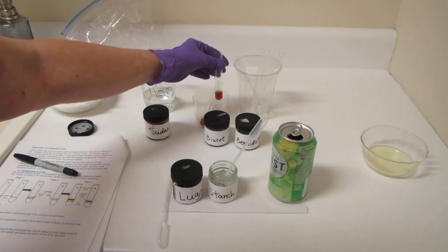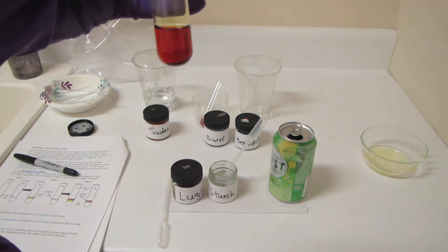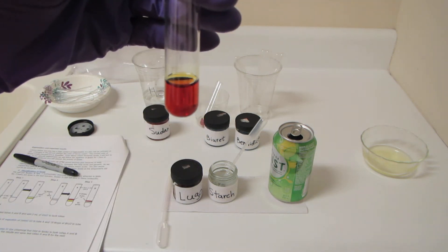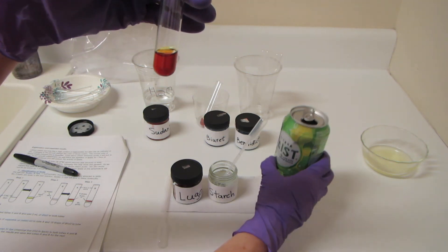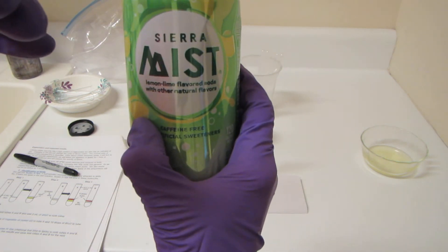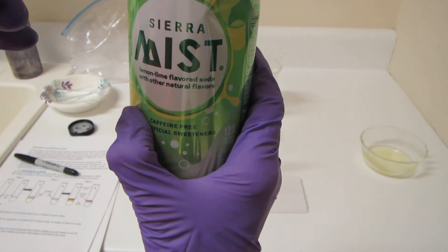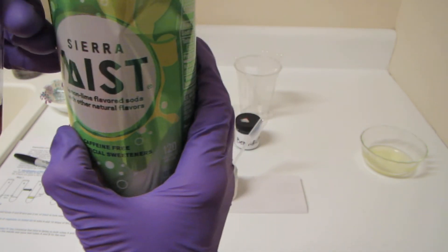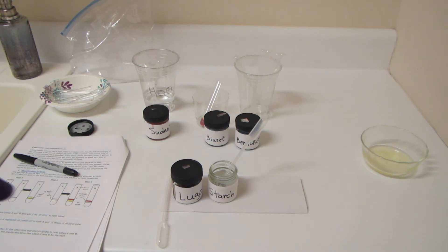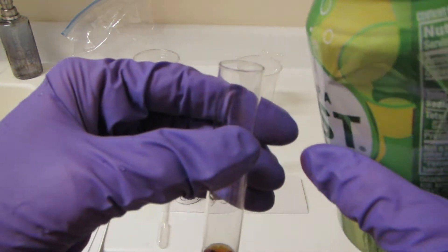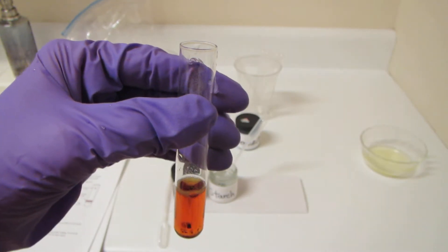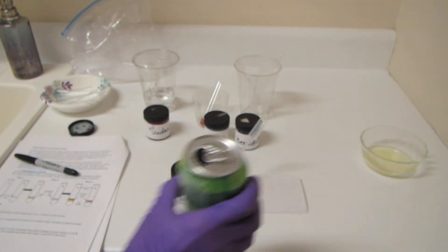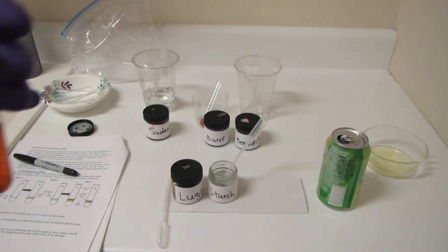I'm going to take one of these and put something in it that contains simple or reducing sugar. Look, we have some Sierra Mist here, and this is the one that has real sugar in it. I'm going to pour a little bit of Sierra Mist into that container with the Lugols, trying not to spill it.